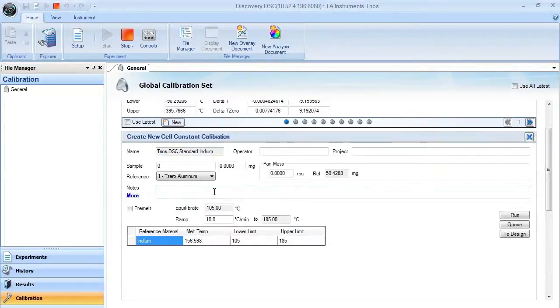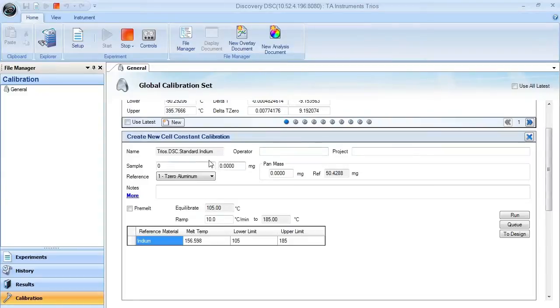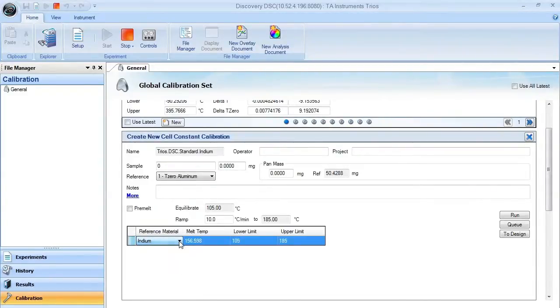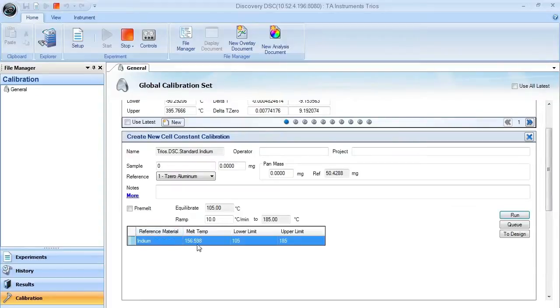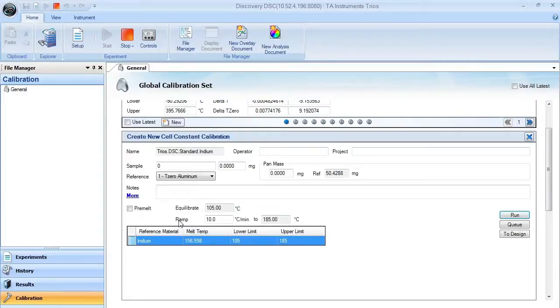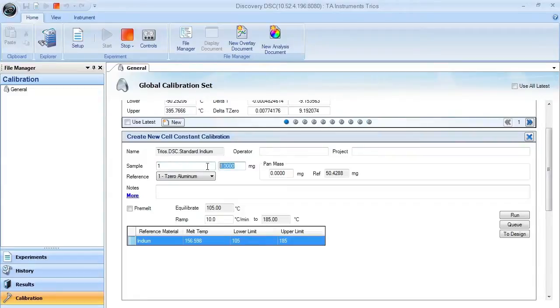In this window, you'll see that you can enter in your operator and project name. In this case, our reference material is going to be indium. So as long as you choose the correct material, you'll have your experiment parameters set up correct for that particular material. Make sure that you choose the correct pan number, sample weight, and pan mass.